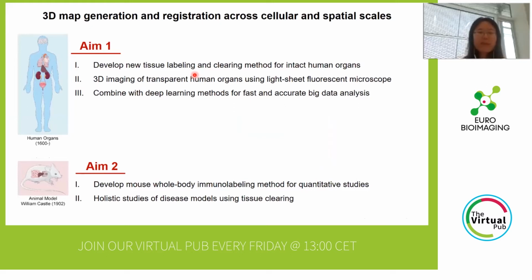First part is related to the human organ. We want to develop a new tissue labeling and clearing method for intact human organs. And also we want to use light sheet fluorescence microscope to generate the 3D map. And when dealing with the data from the large human organs, we want to use deep learning methods for fast and accurate analysis.